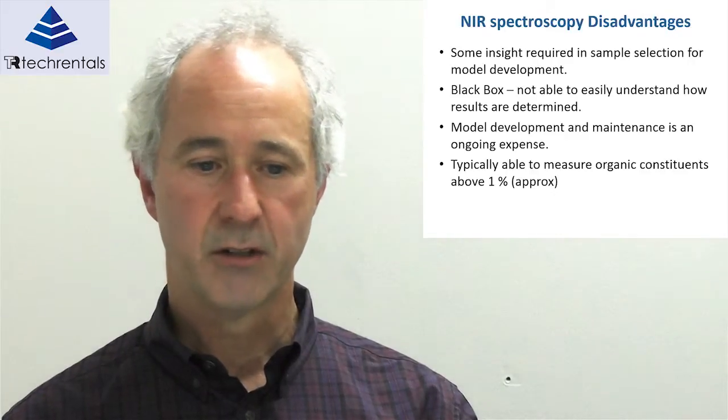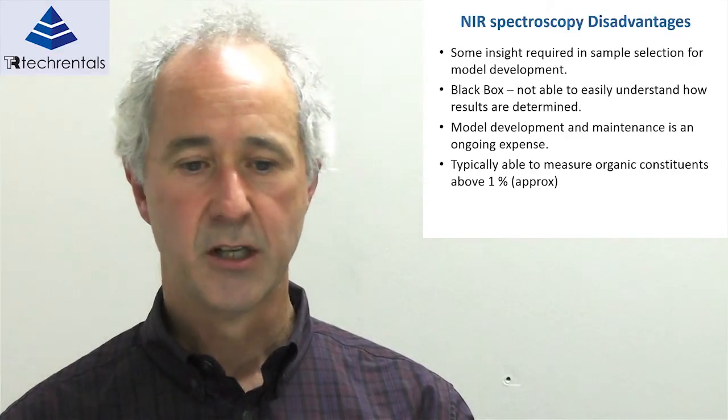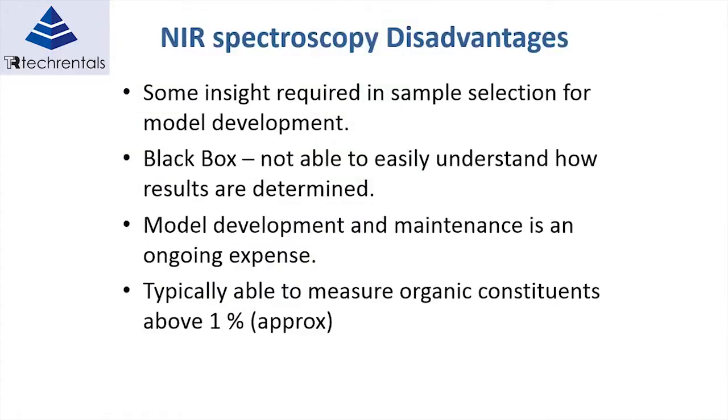So the disadvantages, recapping these. It's important to measure, like all science or engineering. The sample selection is critical, and it's particularly important to match up the sample selection with the spectral data. There's no point collecting spectra from part of your process line and then taking a completely different sample set to measure the actual constituent value. They have to line up exactly to be workable.